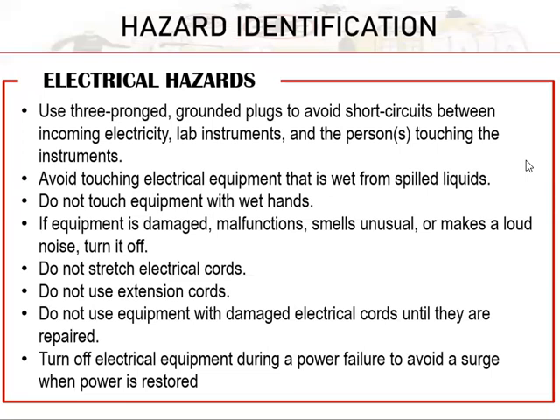If your hands are wet, of course, do not touch the machine. And if you hear an unusual sound from the machine, or an unusual smell, turn it off or unplug the machine. Do not panic, especially if the machine is in your assigned section. Turn it off immediately. It might explode, and it can be a cause of fire.